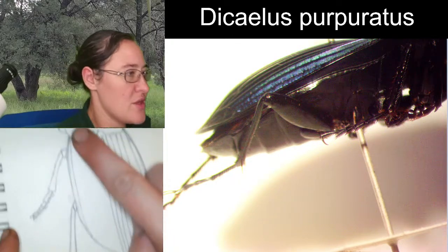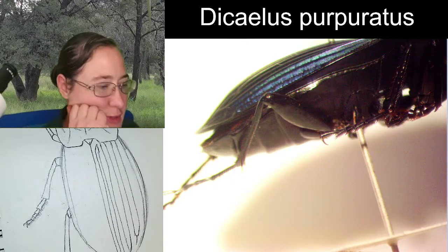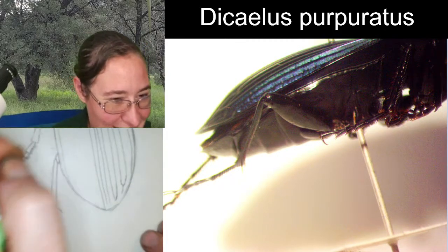So the front tibia is shorter than the middle and the hind tibia. You're welcome. I do what I can.